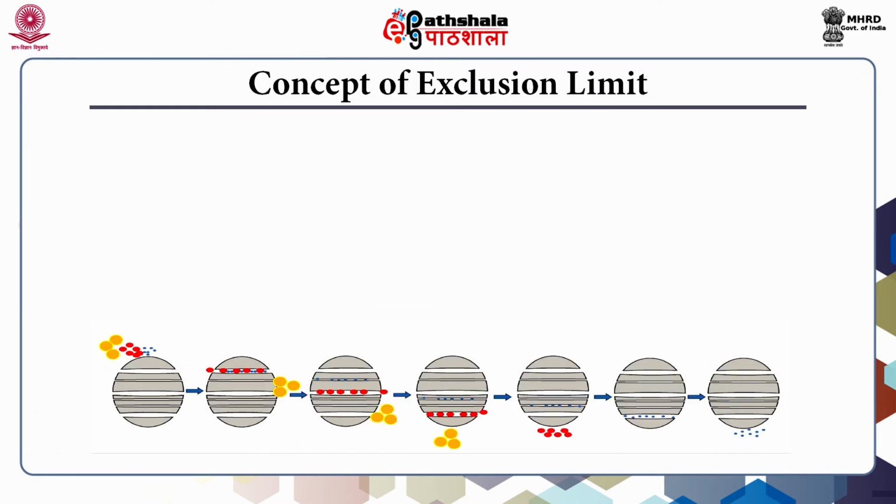So far, we have discussed what gel filtration chromatography is and also its principles. Now, in the previous slides, we understood that the molecules which are bigger in size will not pass inside the pores of the beads. So, that means some molecules are excluded from entering inside the beads. That is called exclusion limit.